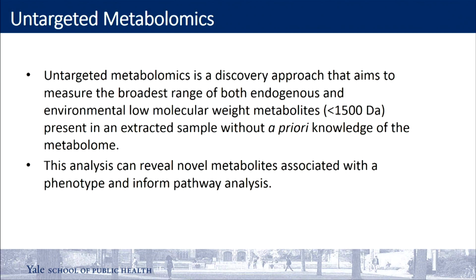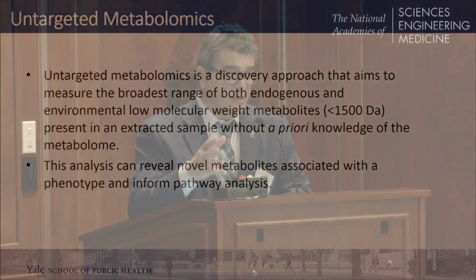I'm going to briefly tell you a little bit about classic metabolomics. This is very basic stuff. Untargeted metabolomics is essentially a discovery approach that aims to measure the broadest range of both endogenous and exogenous molecules, low molecular weight, less than 1500, that are present and extracted in a sample without a priori knowledge of the metabolome. Everybody says it's a fishing expedition; it is a discovery. This analysis can reveal novel metabolites associated with phenotype and inform pathways.